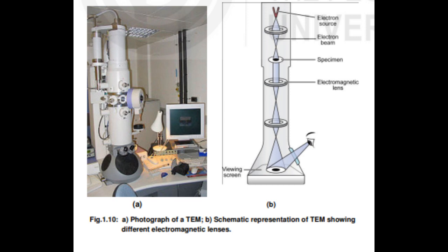1.11. The staining is done with heavy metals such as lead, uranium, or tungsten. The scattering of electrons produces contrast between different structures. The specimens can be stained en bloc before embedding or later after sectioning.